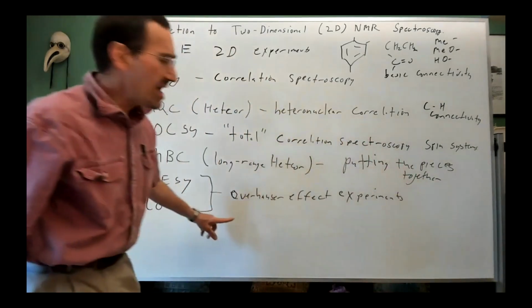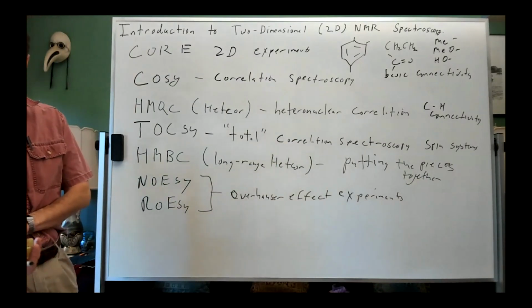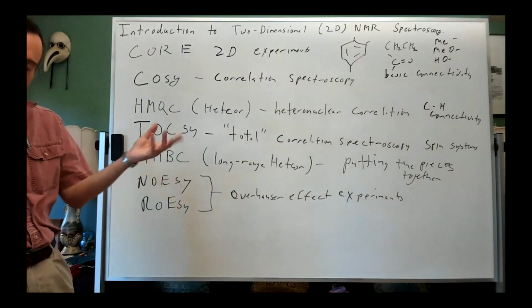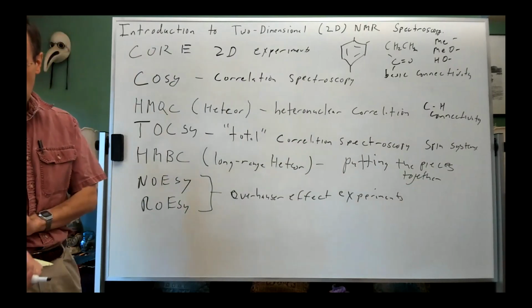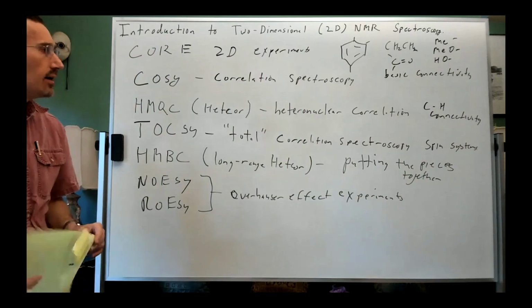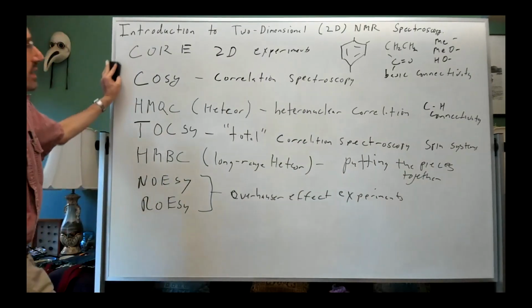And I already gave you an example of stereochemistry where it would be useful. And of course, you've seen this where we've talked about, say, stereochemistry of a cyclohexane ring where we were using coupling.